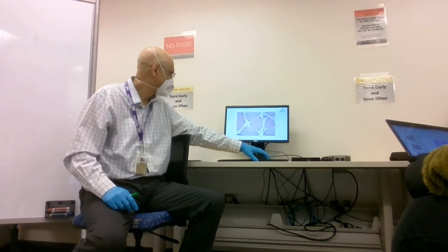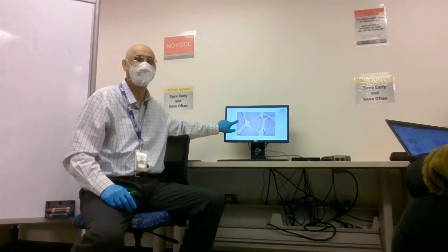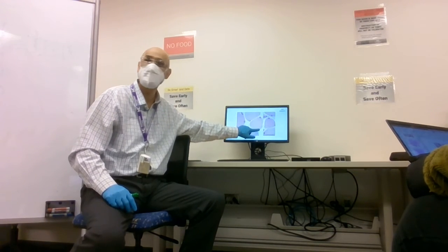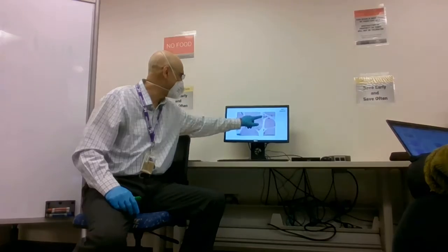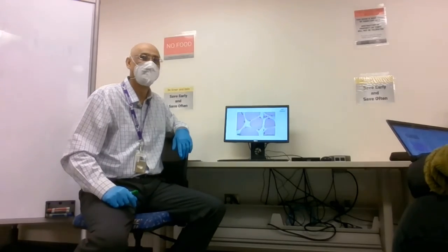Erica, you're the best. Is this a fascicle? Yes or no? No. Okay, this one. This is a cell, right? Why do I say this is an individual cell? Because you see a nucleus, right? This is not a fascicle, this is an individual cell. So if this is an individual cell, what is this connective tissue or this empty space in the middle? That's the endomysium. You good guys or no?